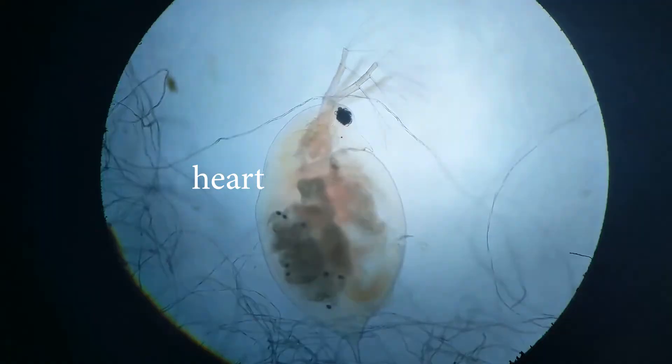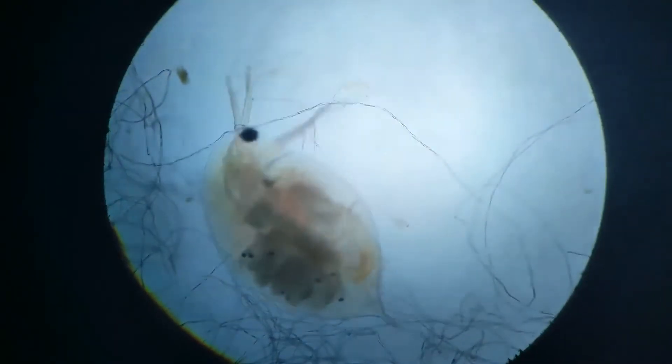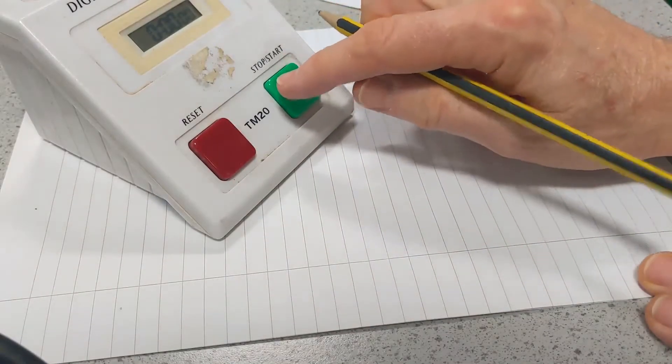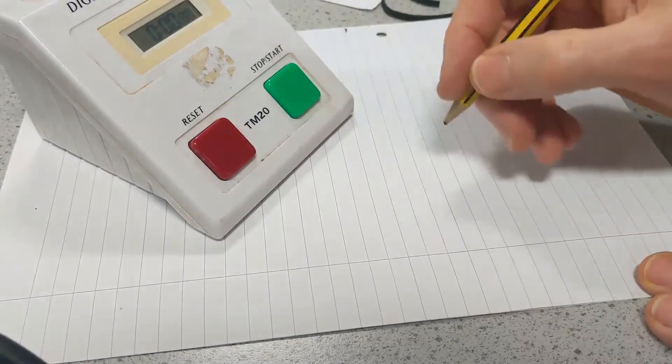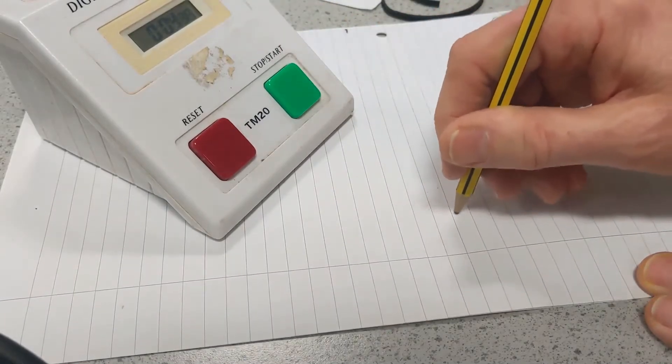So here's your Daphnia and hopefully you can see there's a beating heart behind the gills on the left-hand side. It's beating very, very quickly. In order to find the heart rate, look at the heart and then start the clock. And as you do so, tap out in time with the heartbeat.